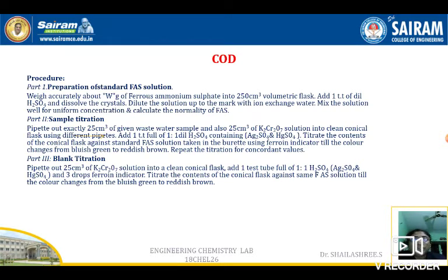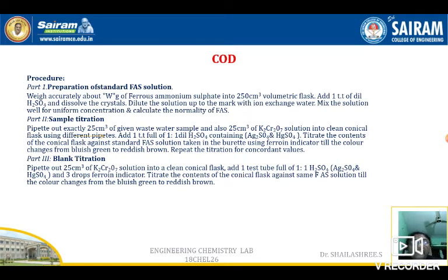You don't know exactly how much potassium dichromate is required, so a known volume is added and the unreacted potassium dichromate is calculated by blank titration. First, pipette out 25 ml wastewater and 25 ml of potassium dichromate. Add one test tube of dilute H2SO4 containing silver sulfate and mercuric sulfate. Silver sulfate acts as a catalyst in oxidizing some organic compounds, and mercuric sulfate binds the chloride ions as mercuric chloride.